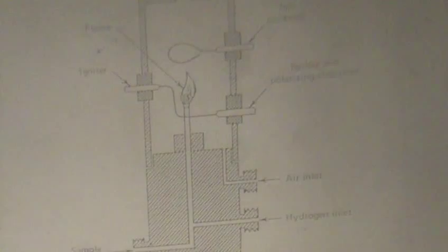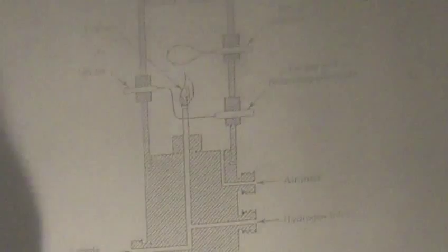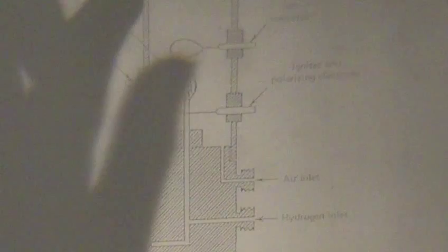and is basically charred in this hydrogen flame, but there's electrostatic potential within the detector, and so what comes out of that flame is free electrons and ionically charged species, ionic fragments, okay? Those ionic fragments are detected at an electrode, so it makes electric current based on those ionic fragments. How much sample is there and how much potential it can create are related to each other. So it's a really sensitive type of detector to use on a GC, because ionizing the sample and then collecting on an electrode is a really sensitive method for determining how much is in that sample. So it will tell you peaks and then how much was there of the peaks.